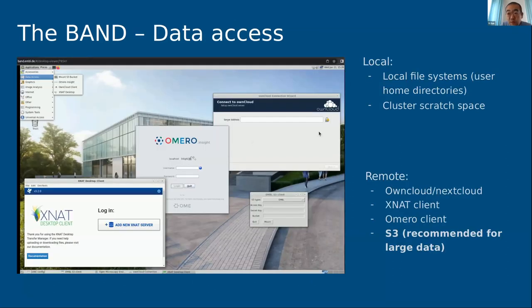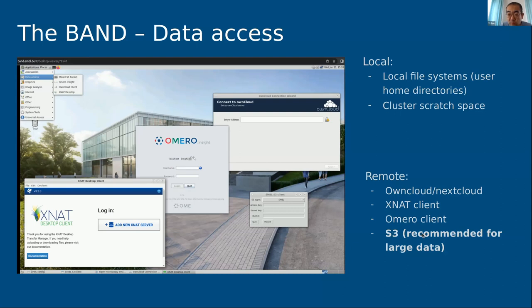There are two types of data access. Local: you stage your data in your home directory or scratch space before your session. Remote: you can use data access clients available under Applications > Data Access. S3 is the recommended storage type.